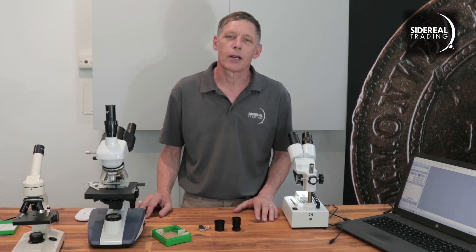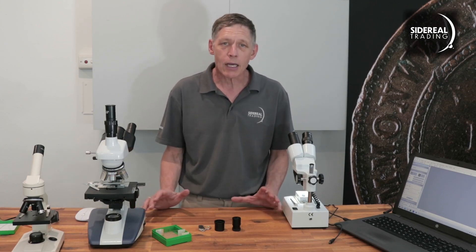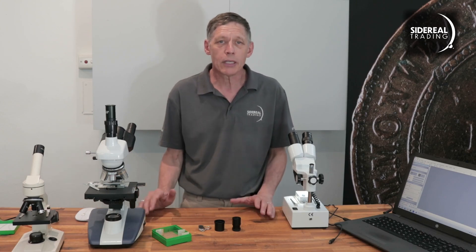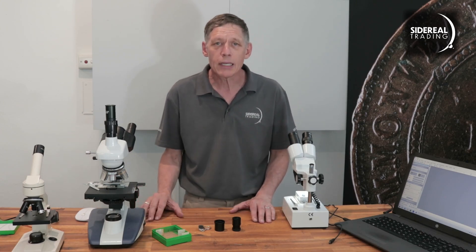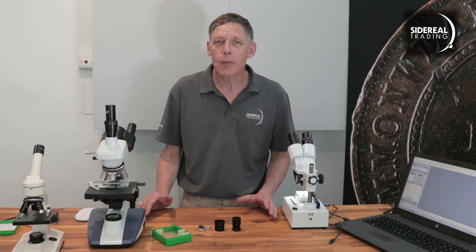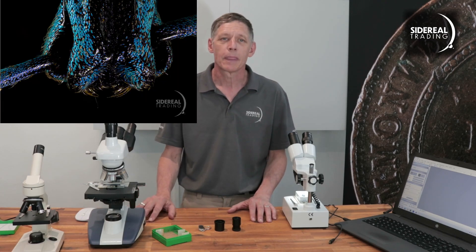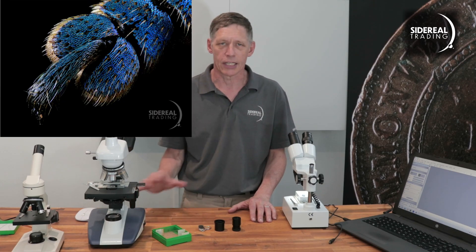So that's our three different microscope setups. Using a camera of the right size, or with the right adapter, you can get some really cool and useful images — good for school projects, teaching, hobbies, or just plain being geeky. The 5 megapixels means you can do a fair amount of digital zooming and concentrate on the parts of the specimen you want. If you're wondering how we got such detailed and deeply focused images of Diego's Euphilis Weevil, that's an entirely different setup using a Wee Macro rail — I've talked about this in other videos and blogs and I'll attach a link in the notes.